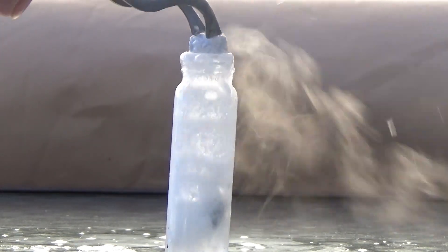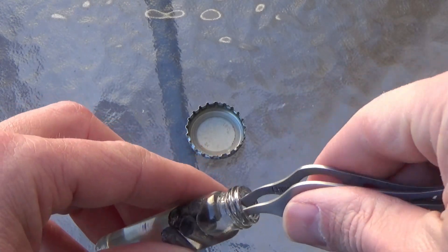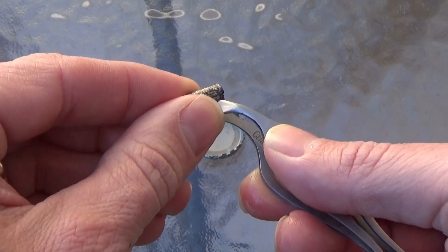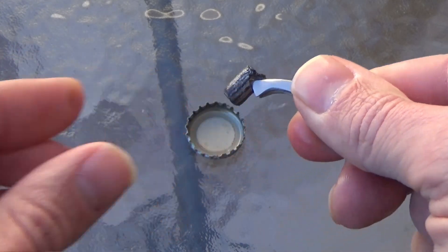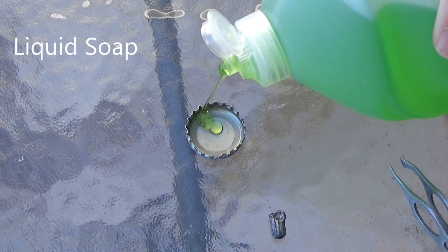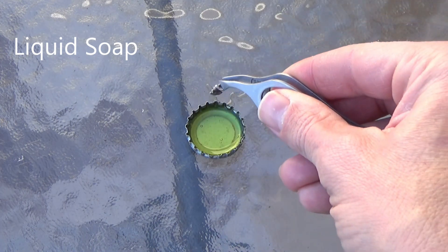First we're going to start off with liquid soap. Next, see how it reacts with liquid soap.